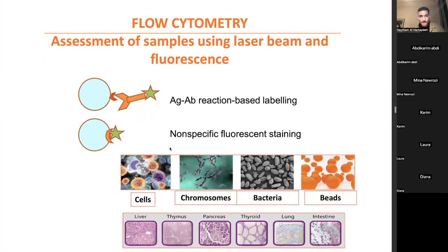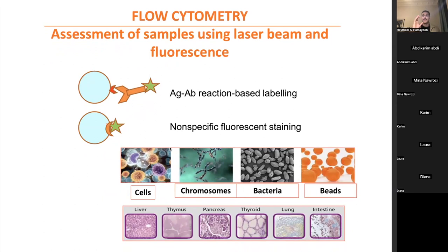Flow cytometry. Now, same arrangement of cell antibody and the substance that is used for separation. But in this case, the substance is not a magnet. What is it? It's a fluorescent molecule. A molecule that reflects light when light is shined on the cell. Any questions? Because this part can be very confusing.